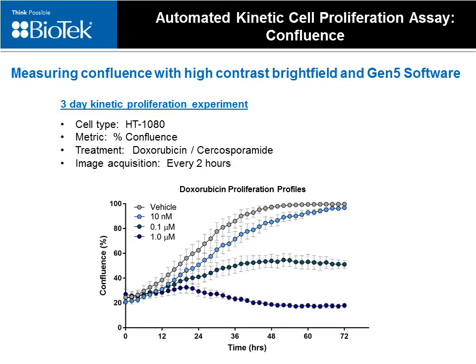Now, if we compare the confluence profiles for each condition, as we see in this figure here, comparing multiple doxorubicin concentrations, this provides a very informative and intuitive readout of the treatment response corresponding to dosage, but also it really gives you a clear understanding of how the response varies over time. And this allows you to determine optimal time points for analysis retrospectively rather than being restricted to a single unoptimized predetermined endpoint at the onset.